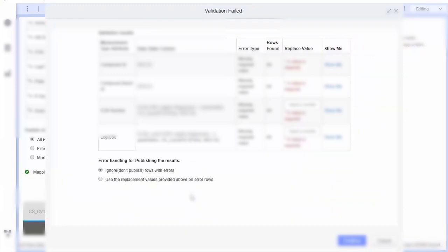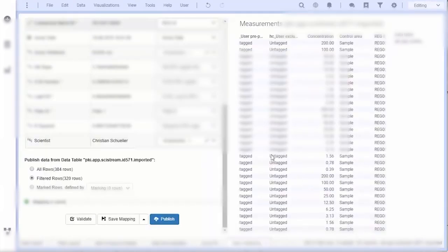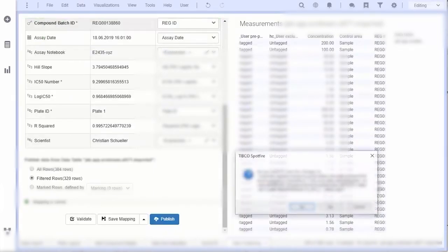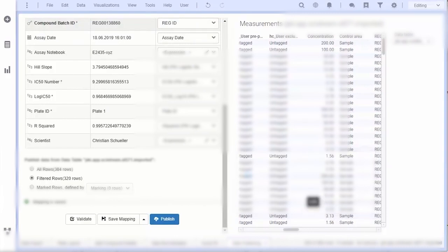Now you can decide if you want to save it as a new dataset or use it to modify an existing dataset. The defined results are now saved to the data lake and will be available for downstream analysis in Signals Inventa. The whole analysis file, containing all the modifications we did in this process, is saved back to the Signals Notebook where we started our analysis.